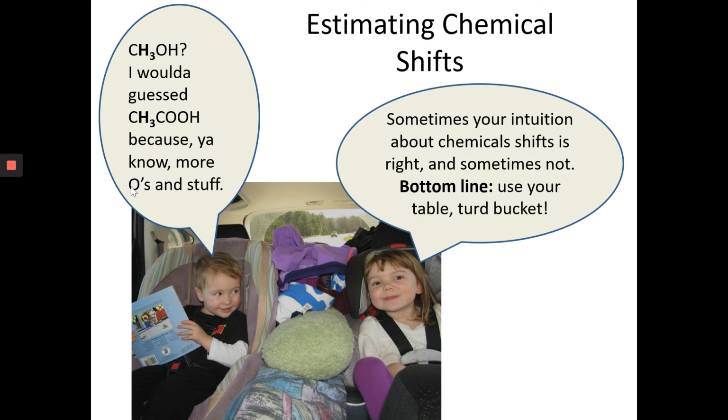So here's the bottom line. Sometimes your intuition about chemical shifts is correct, and sometimes it's not. So the bottom line is you need to use your table.